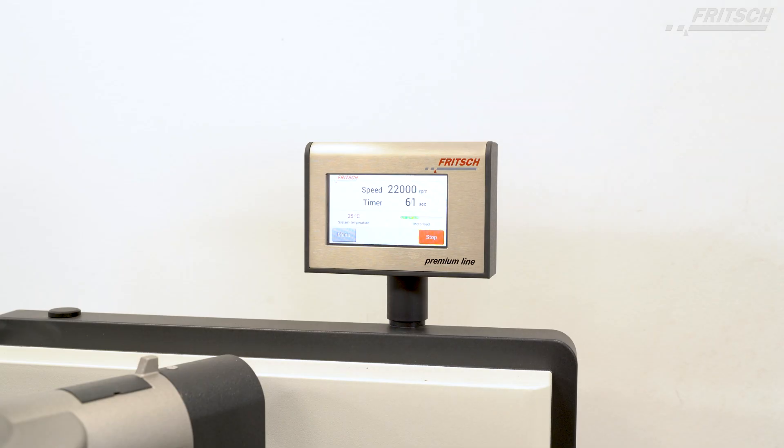A stopwatch function facilitates time recording, for example for new samples.